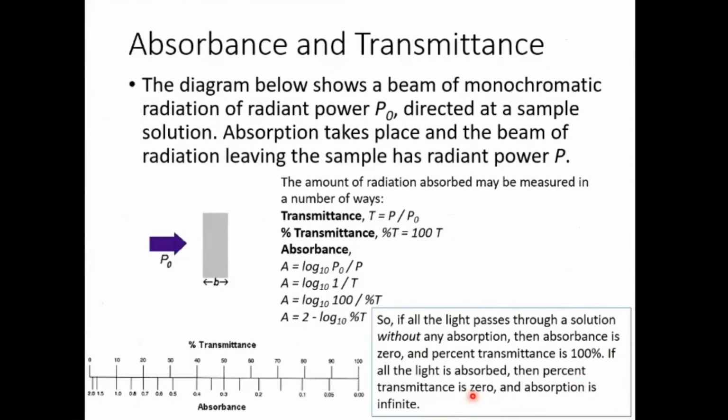Kailash has asked whether A is inversely proportional to transmittance. This is a very common misinterpretation. Do not forget there is a log term.